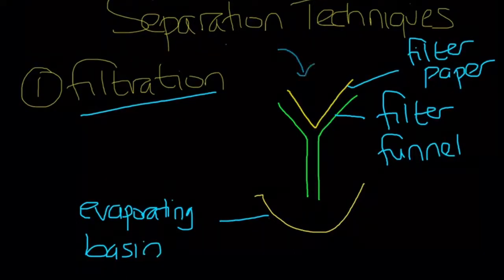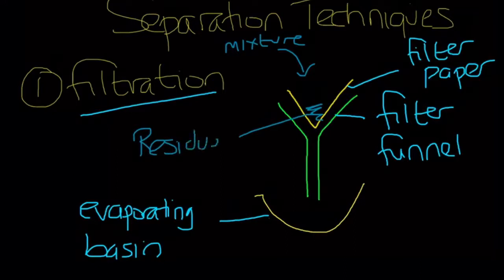The mixture is poured through the filter paper. The insoluble solid will remain in the filter paper and it is known as the residue. And the liquid will filter through and it is known as the filtrate because it has filtered through the filter funnel.